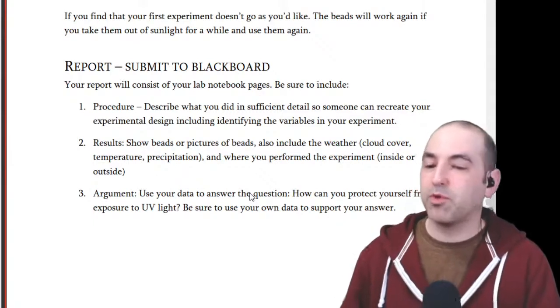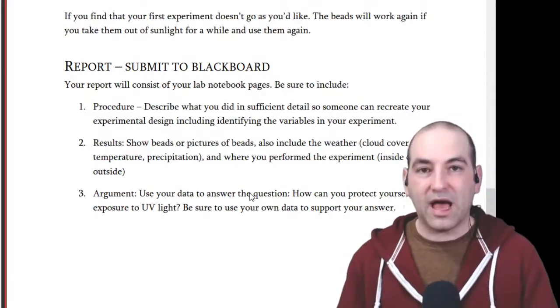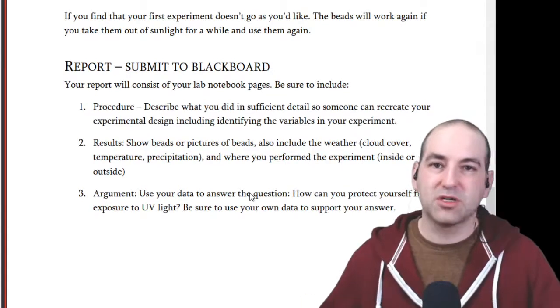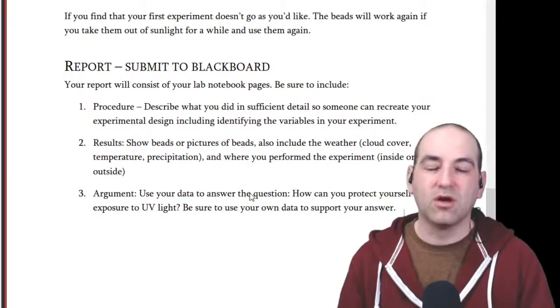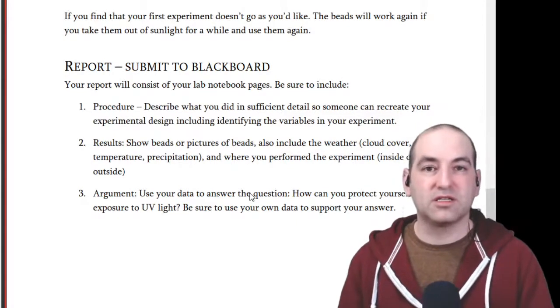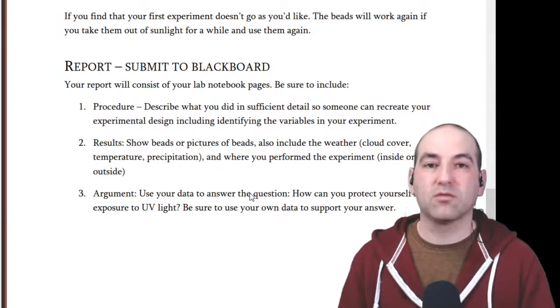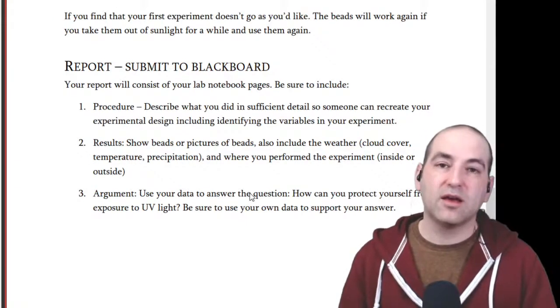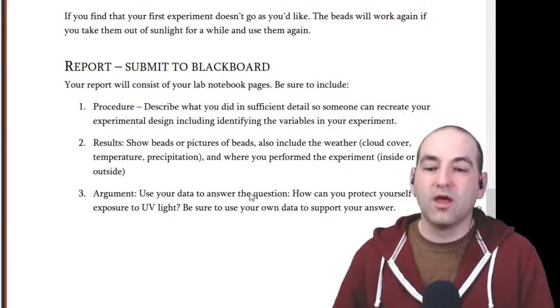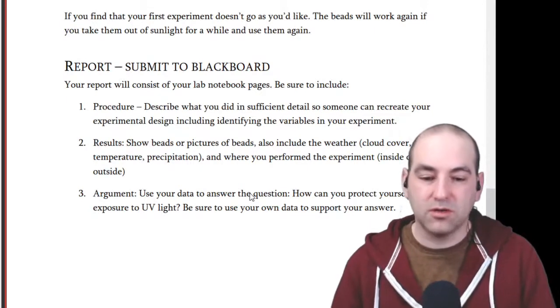And then when you support your answer, this very last part is important: it should be based on your own data. So what did you actually find out? I don't want to know what people have published about sunscreens for this experiment. I want to know what you found out in this experiment. If you haven't done the article report for the scientific paper yet, and this interests you, you could find some scientific reports on sunscreens and use that to get more information and maybe inform your result. But your results for this experiment should be just, what did you do?